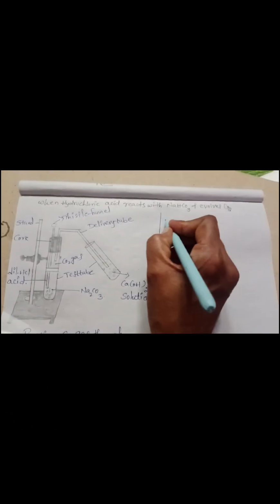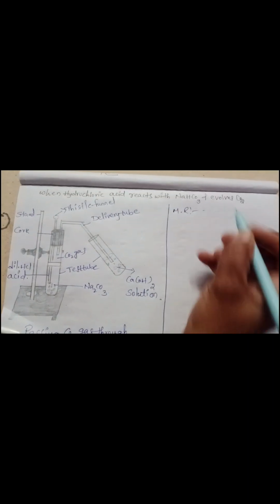So let's see the materials required. I show them in the diagram. We need 2 test tubes, dilute hydrochloric acid, a stand, a cork, a thistle funnel, a delivery tube, and sodium carbonate.